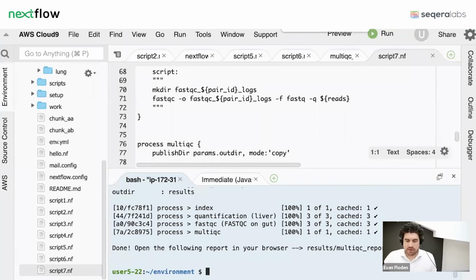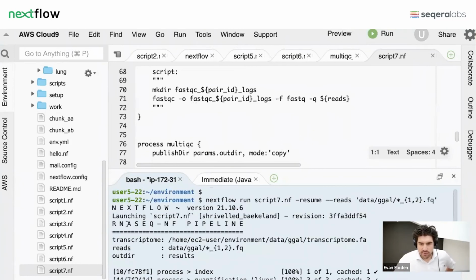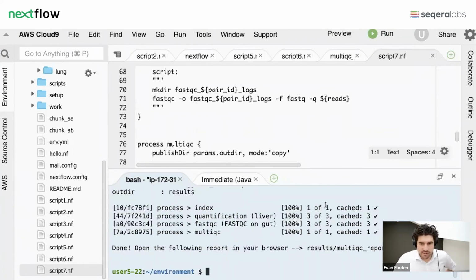Let's jump back in now and look at some of the other things that we can do, not specifically around the syntax of Nextflow, but other ways that we can use it. We can use this pipeline as a good example. When you launch the pipeline, so far we've just been using the output of that pipeline. In this case, we created this log so we can see exactly what we've been running. We also have the output itself, but we can go into a lot more detail in terms of different outputs that Nextflow itself creates, things like reports, traces, timelines, etc. And if you look at exercise 310, we can run the same pipeline with all the different options.